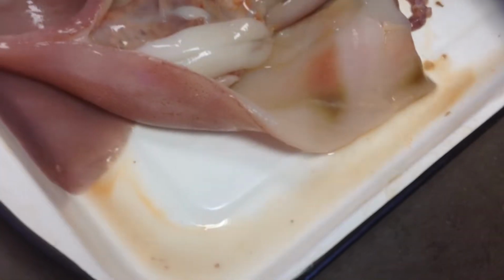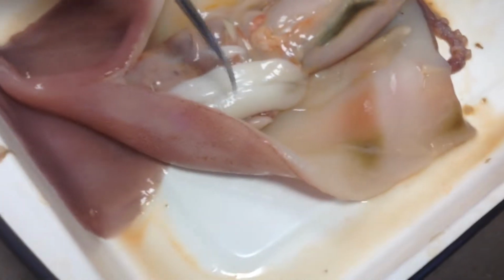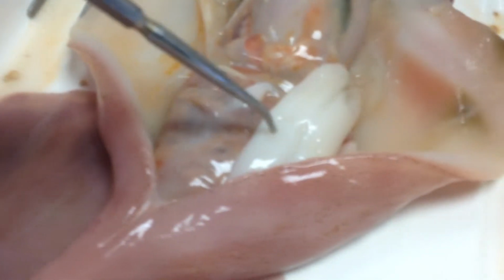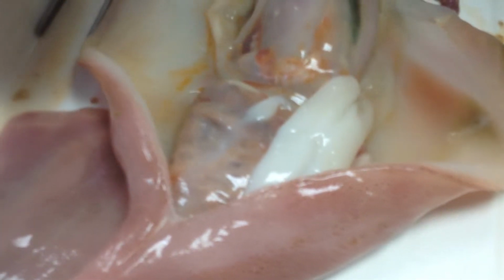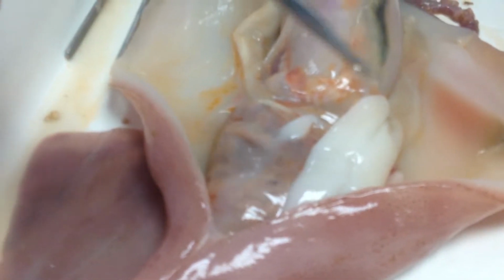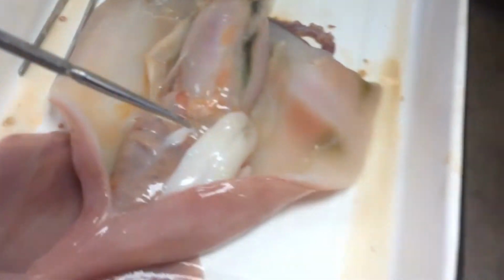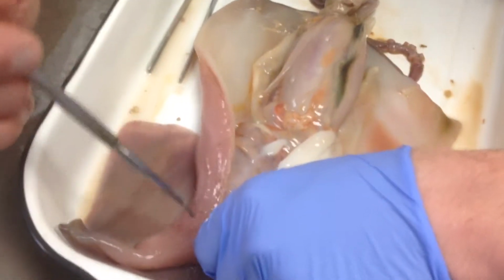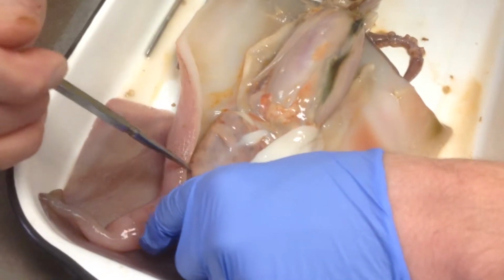We could track it to see where it ends up. I wouldn't poke it. But these are definitely... So I see one. There's actually two of them. There's two of them, and there's two eyes. Yeah, it's bilaterally symmetrical. This is bilaterally symmetrical, guys. Right? Don't you think? If it exhibits that symmetry, my guess is that it's pretty high up on the evolutionary scale.